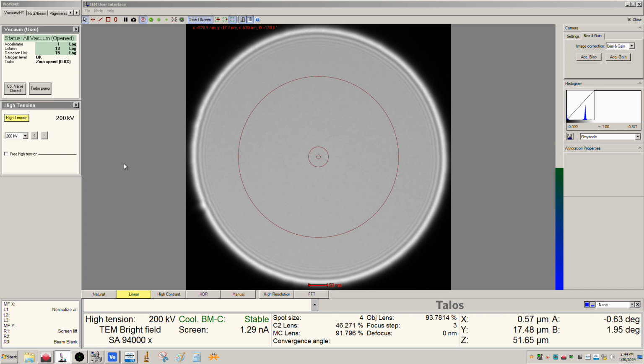And so you most certainly are doing this when you are imaging your sample. But you may never see the effect of it, because as you create the damage, as you create point defects, there's obviously some recombination of the defects. So you have damage generation and you also have damage removal at the same time, because you're creating an activated state with the point defects, and so some of them recombine. Not to say that we can't see point defects in STEM, but usually we don't directly see them.